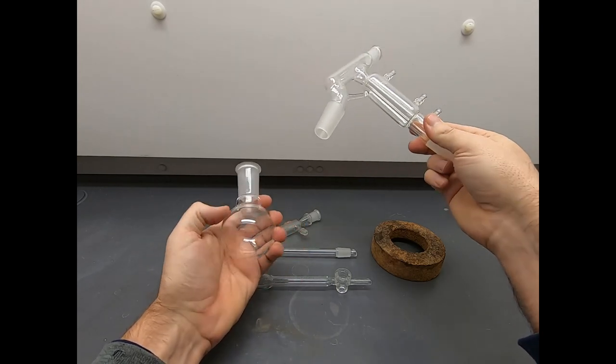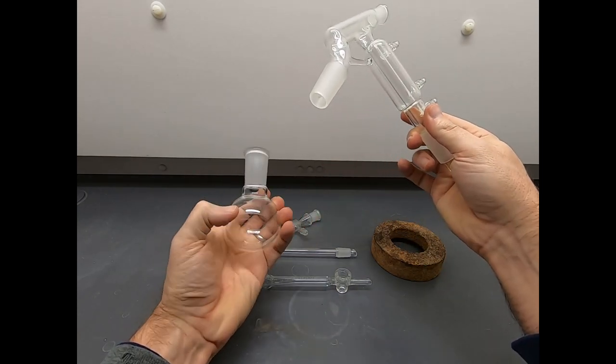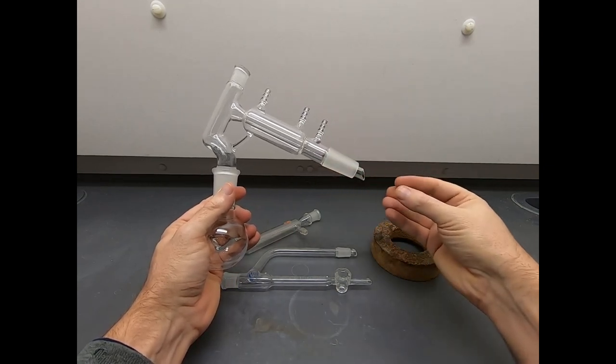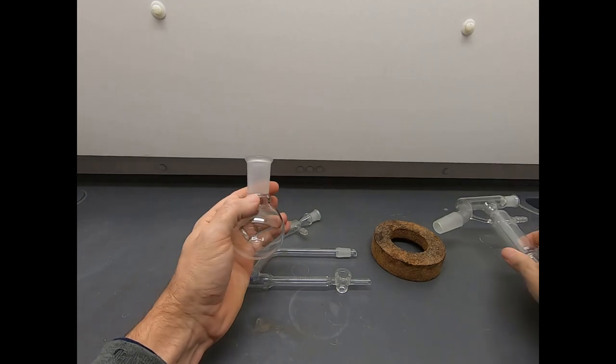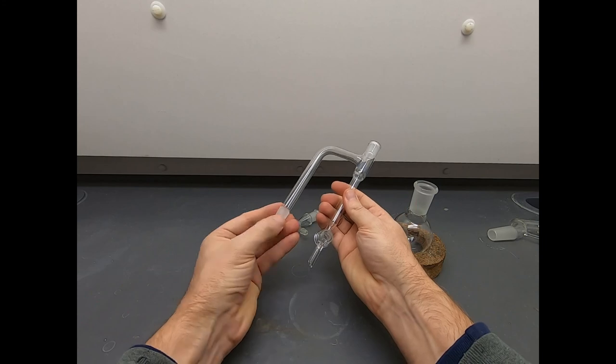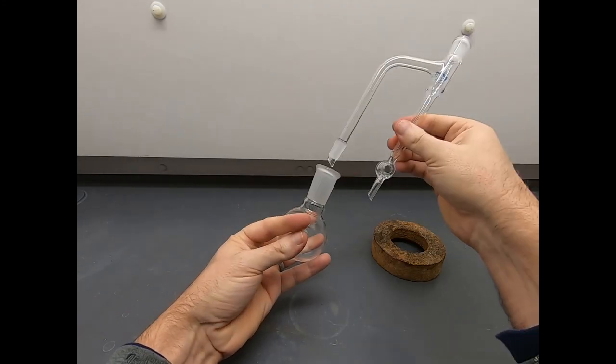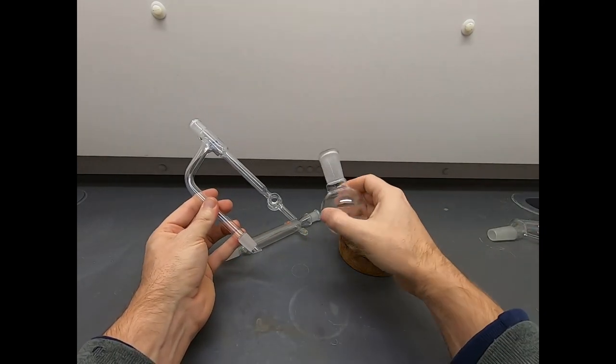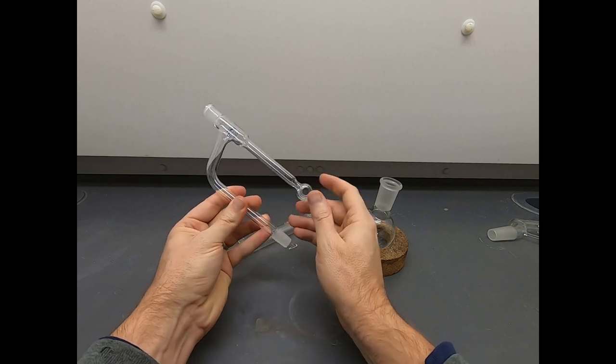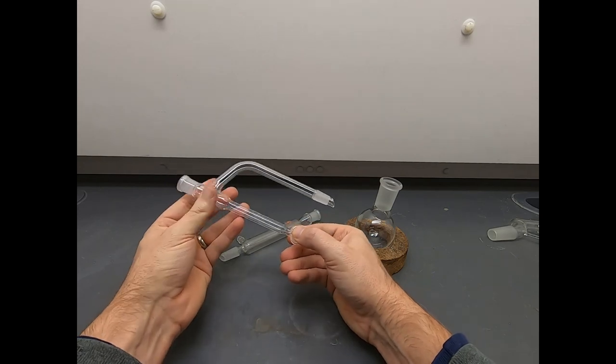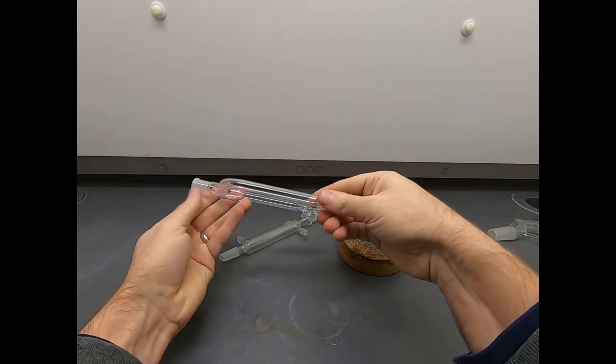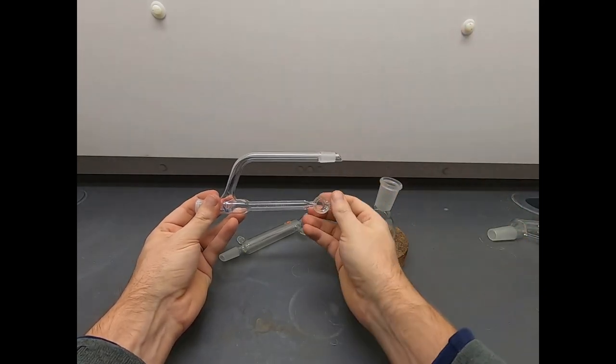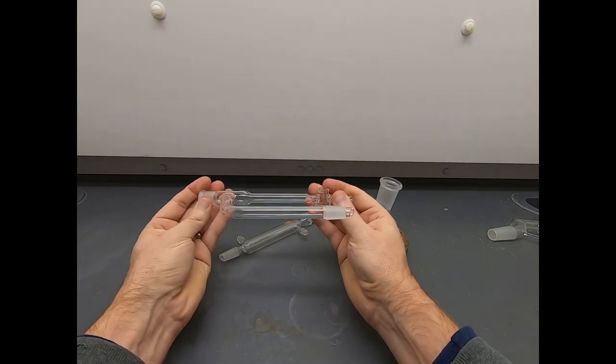The joint sizes have to match. This is one size of joint. It's called a 24/40 joint. This is one of the standard sizes you encounter, and that fits nicely into this still head. You can see we could put another flask or receiver of some sort off of this end. The other common size that you encounter is this smaller size. This is a 14/20 joint, and the 14/20 joint does not fit with the 24/40 joint. So your glassware is limited by what sizes of joints you have, but in modern glassware, 24/40 and 14/20 are the two common ones. Other ones appear here and there, and if you get into someone's old glassware collection, you'll find all sorts of different sizes. You will see in laboratory different pieces of glassware that have all kinds of different designs. Those are specialized pieces for specialized functions, and as you do more chemistry in the laboratory, sometimes you'll need those functions, and so you'll try to find one of these fancier pieces of glassware.